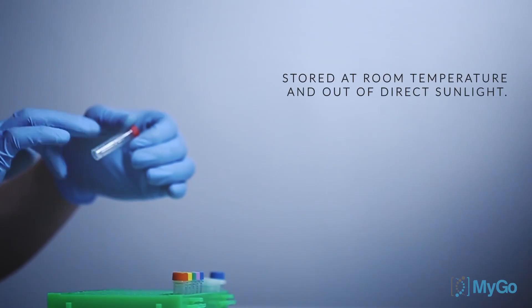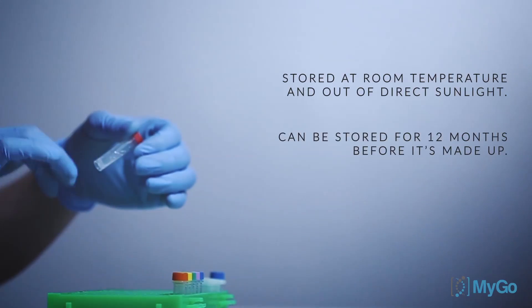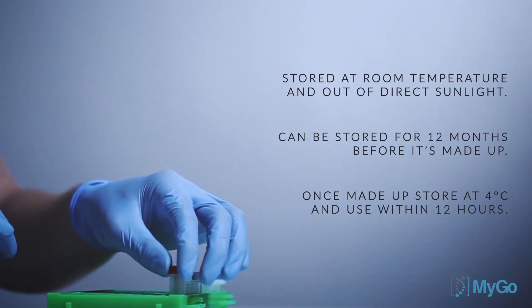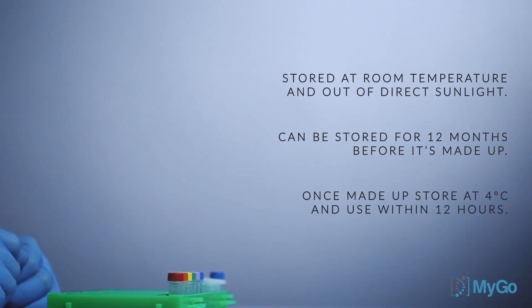The MYGO5 demo kit should be stored at room temperature and out of direct sunlight. It can be stored for 12 months before it's made up. Once the kit has been made up, store it at 4 degrees C and use within 12 hours.